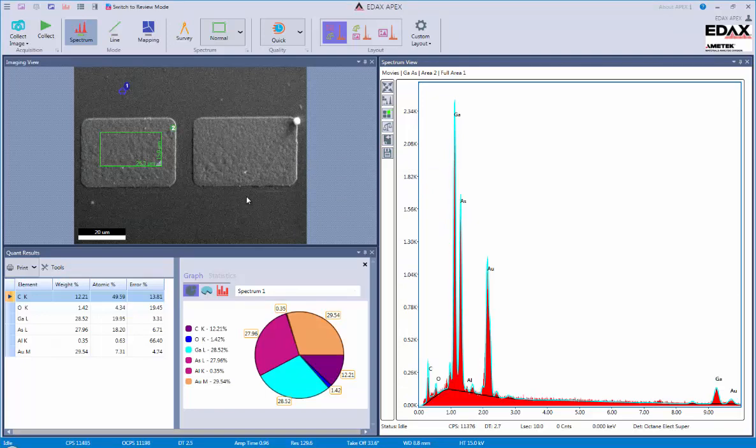This will conclude the EDX APEX general layout of the software.